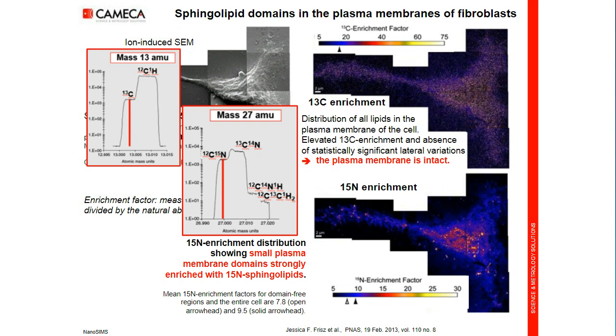And so the strength, or the uniqueness, of the NanoSIMS is to ensure high mass resolving power to separate the peaks, while keeping high sensitivity and 50 nanometer spatial resolution. Note the sharp mass peak side and the high dynamic range shown in logarithmic scale.